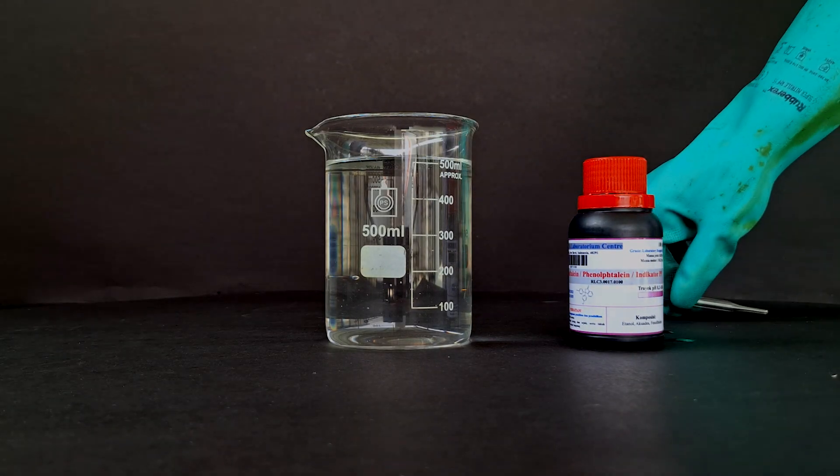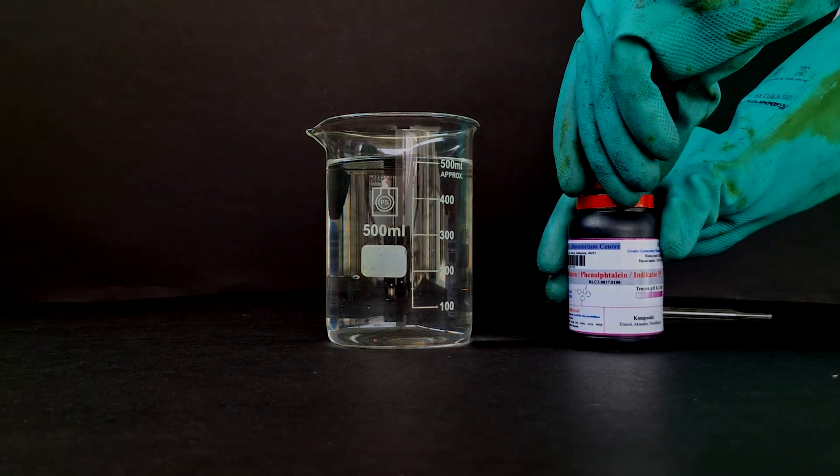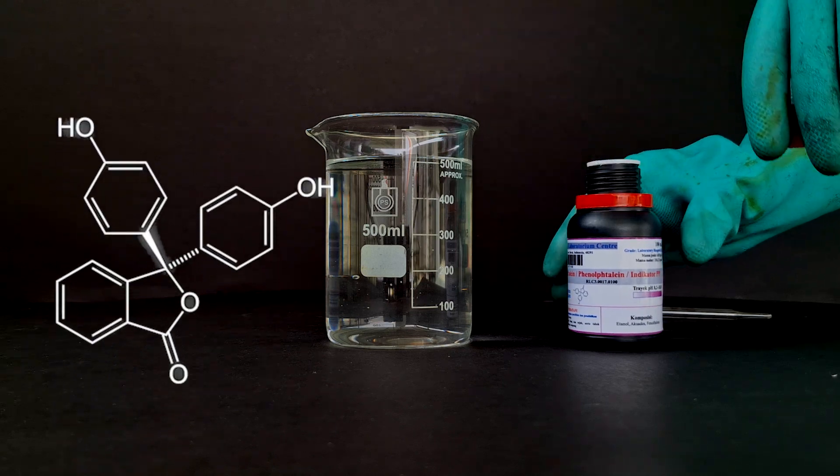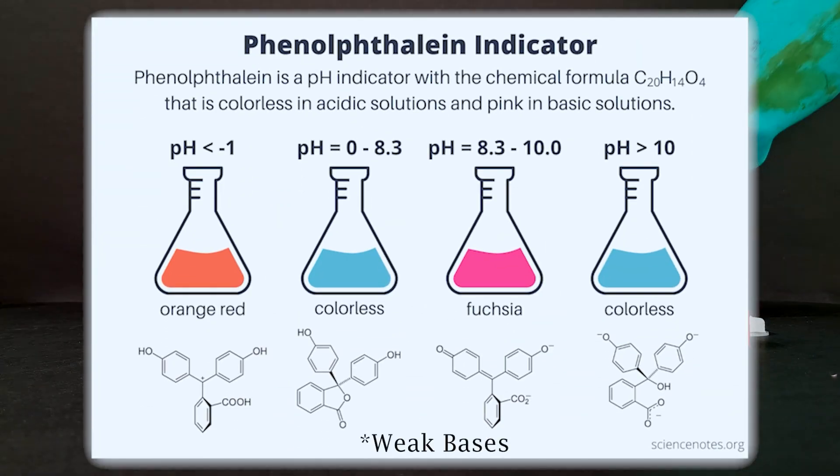There are many indicators commonly used for this experiment. However, the most commonly used is undoubtedly phenolphthalein, due to its powerful pink color in the presence of bases, such as ammonia.